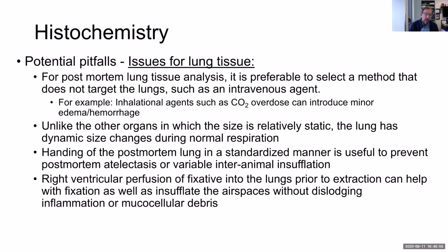Another thing, with looking at lung tissue in particular, is that the method of euthanasia could influence the outcome. So for example, inhalational agents can introduce edema and hemorrhage. So having the appropriate controls is important, or you might want to select an intravenous agent.